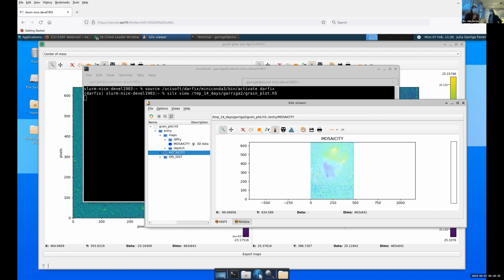You can just try to use the find dimensions. You change the metadata type to positioner first of all. You make sure it's in that way, and then you click the find dimensions button. What was the first step you mentioned? Select the positioner in the metadata type. It would be default by default, but you change it and you put it to positioner. Yes, and now it's like this. You click the find dimensions button.